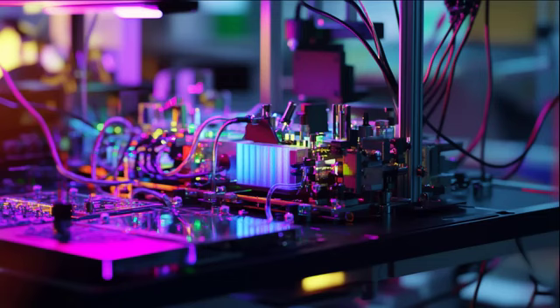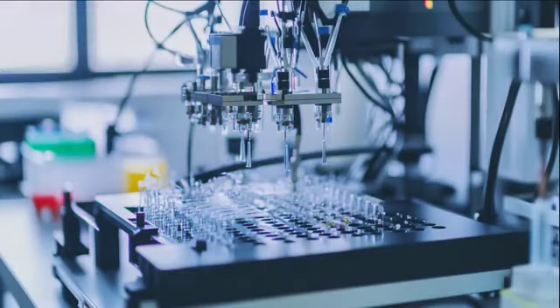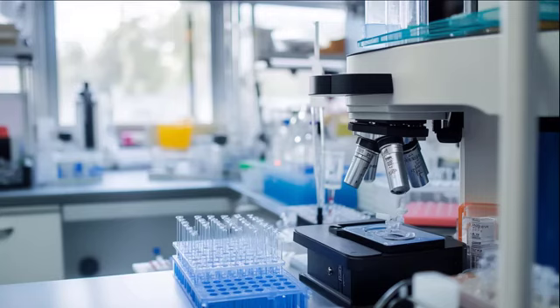Rapid prototyping techniques in lab-on-a-chip fabrication allow researchers to iterate designs quickly and efficiently. For example, 3D printing can produce a new chip design within hours, much like a sketch artist can rapidly create multiple drafts of a portrait until the perfect likeness is achieved.